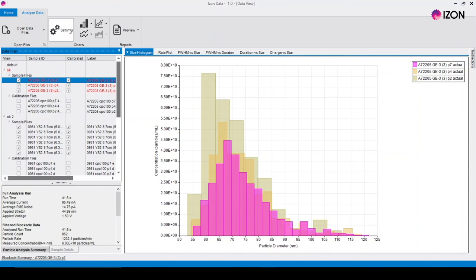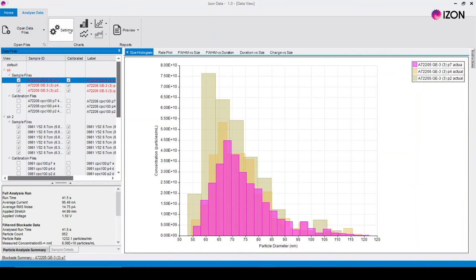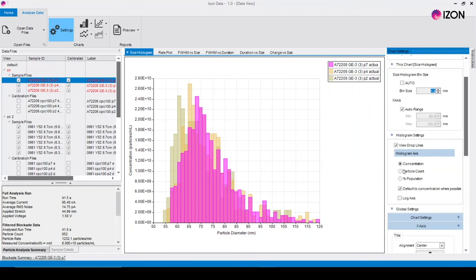To change the chart settings click on the settings button for the chart that you wish to change. This brings up the settings menu where the charts can be customized to your needs.